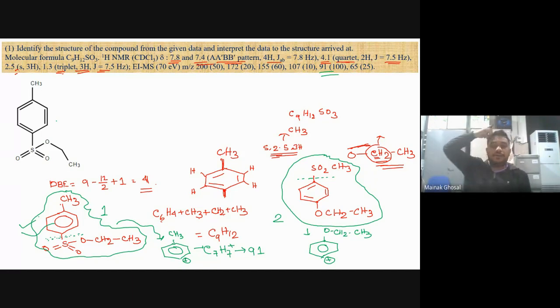Now from NMR you have got all this data. Now you need to assign all the peaks. I have told you this methyl protons is 2.5. You have got all this data. So this is nothing but 2.5, right? This methyl, what is given? 1.3. This ethyl is 4.1.